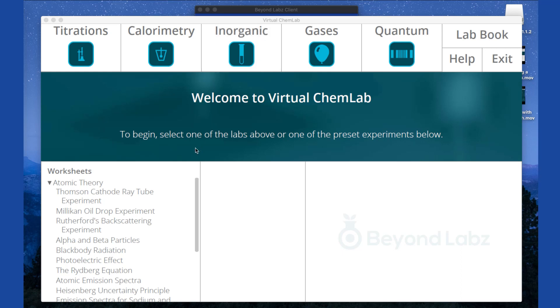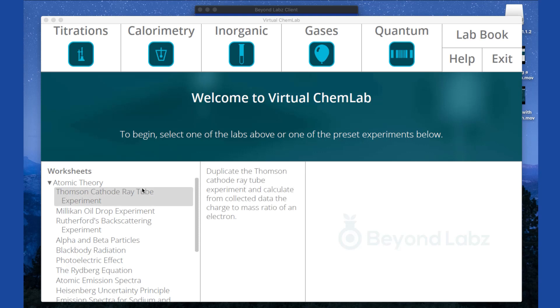In the bottom left-hand corner, we have the worksheet section. Students working on Beyond Labs assignments will much more often be clicking on the links here than they will on the open-ended lab bench icons on the top.